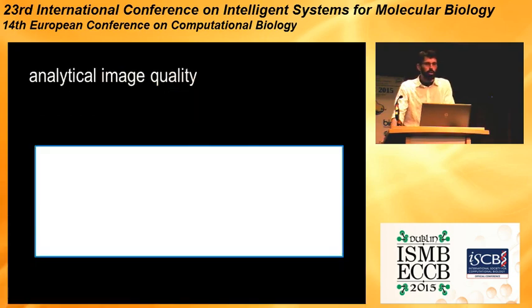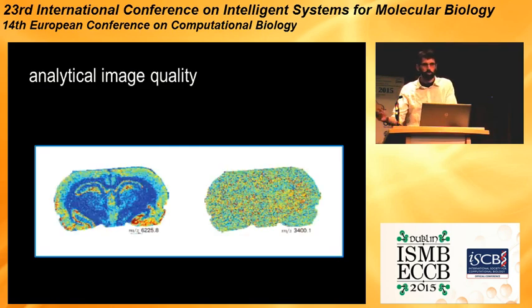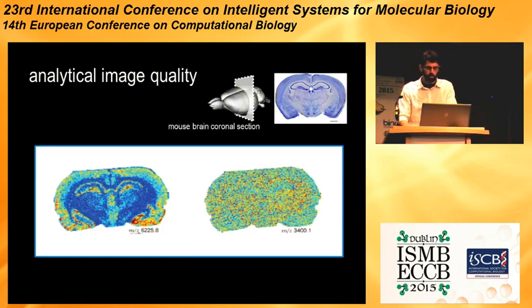And so image quality is obviously of paramount importance for any analytical data. You face the garbage in, garbage out problem, and this is just as true with image analysis-based analytics. Just to illustrate how good humans are at pattern recognition, if I show you these two images, I'm sure you'll agree that the image on the left shows some structured patterns, whereas the image on the right does not. And despite none of you being mass spectrometry experts, you've correctly picked out a distribution that corresponds to a peptide that's localized with the neural bodies in the rodent brain.